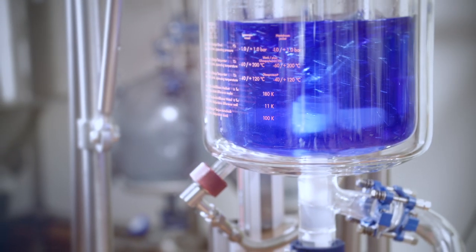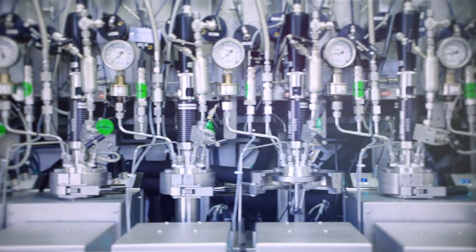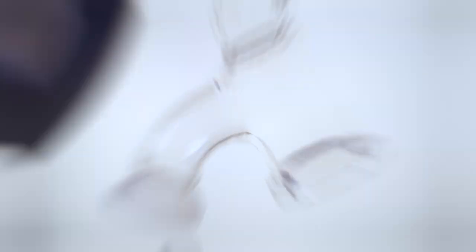For every action, there is a reaction. Just like in our reactor systems and chemical plants. We connect, convert, and combine. Powerfully, transparently.